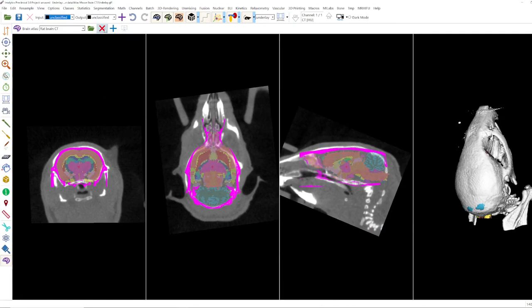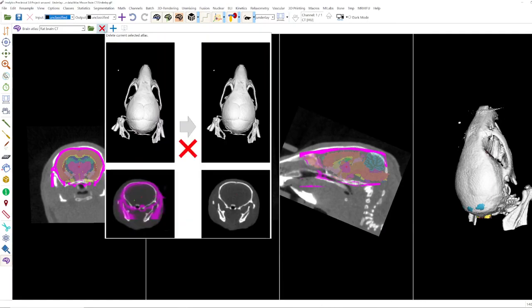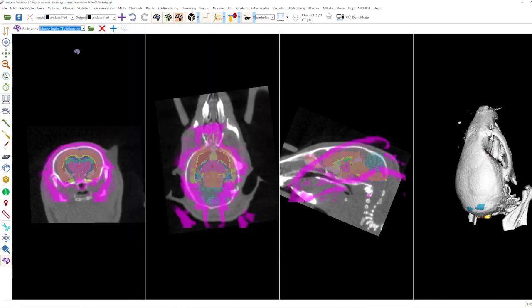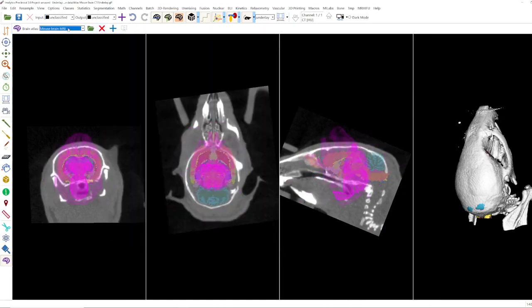Here you can delete the current selected atlas. So when I go now here, it's now deleted.